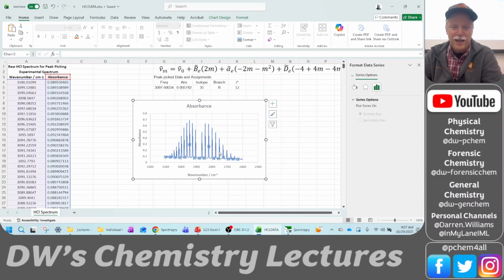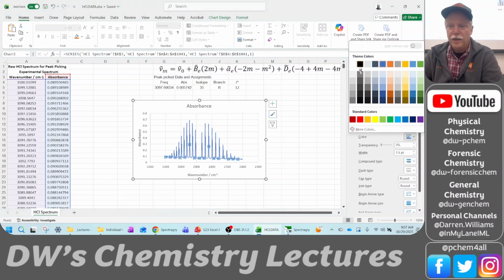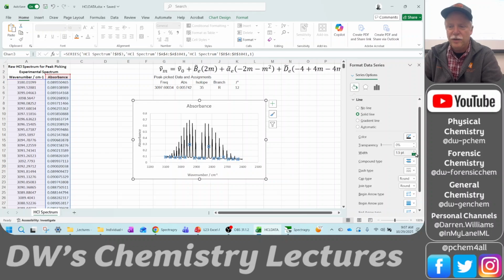Now these big fat lines I think are ugly. So you come back over here to the paint bucket. We can make them black. You don't have to use color unless there's a reason. Okay, and so I just change the line width to make it thin, so it looks nicer. Yeah. So that's a nice looking spectrum.